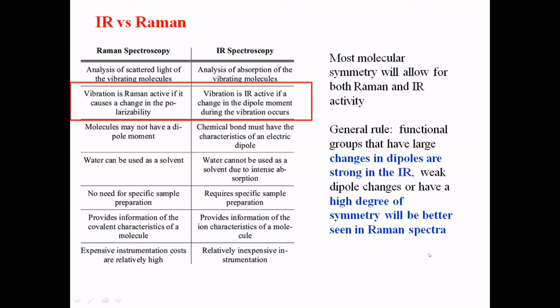Other things, maybe the solvent usage and the sample preparation for IR are a bit complex. You need to have a proper standard. That kind of issues are there. In that way, Raman is very simple. You need not have any special sample preparation, or literally no sample preparation is needed for doing Raman. And of course, it's quite precise information and a quick technique to get the structure.